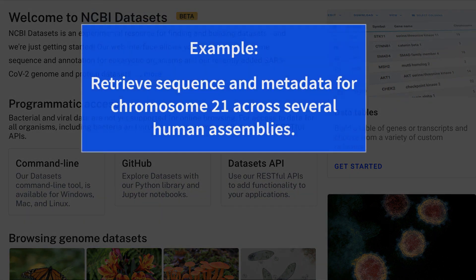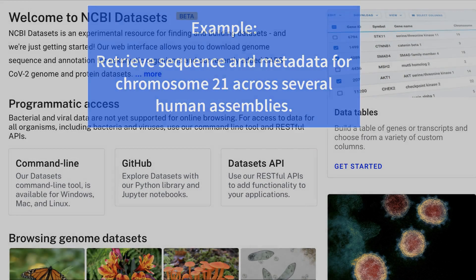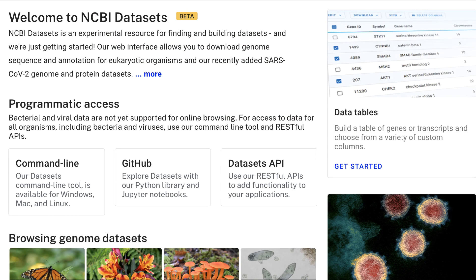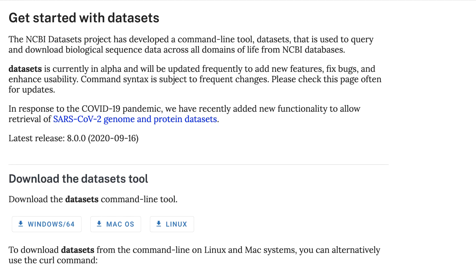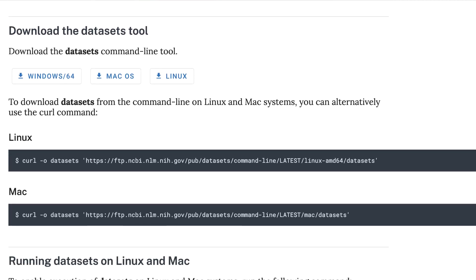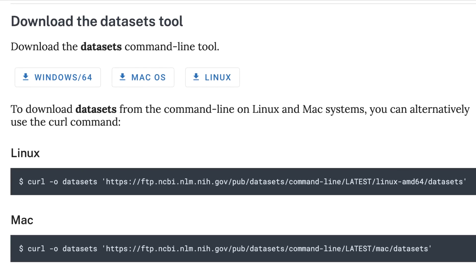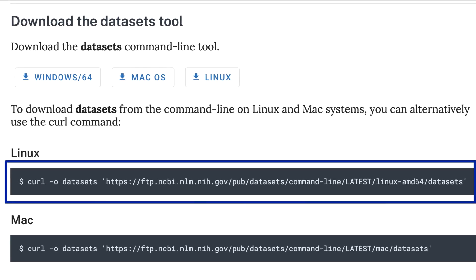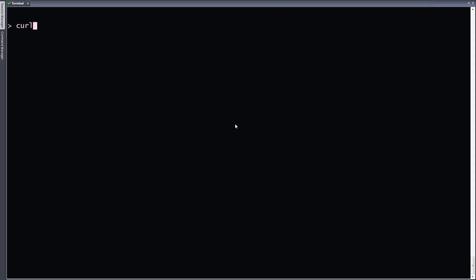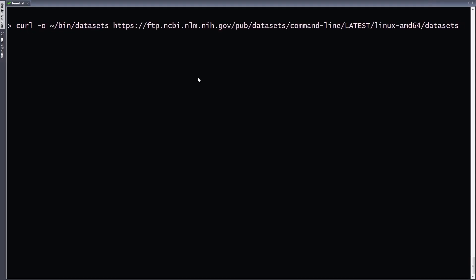To demonstrate how to use Datasets command line tools, I'll start with a simple example that shows how to gather sequence and metadata for a single chromosome across several human genome assemblies. On the Datasets homepage, select command line and you'll see the download instructions. For this demo, I'll be using a Linux terminal. To download the Datasets program, you can simply copy and paste this curl command, or copy the URL and paste it into your own curl command.